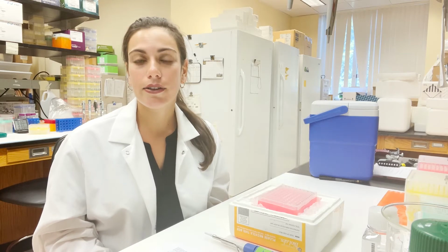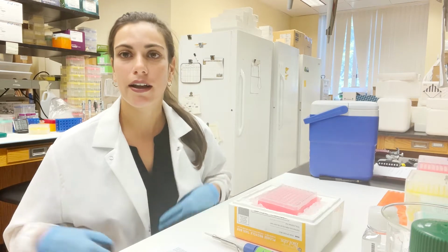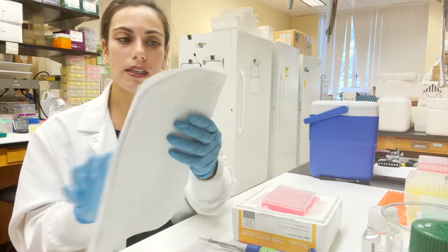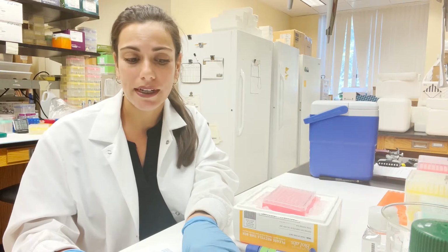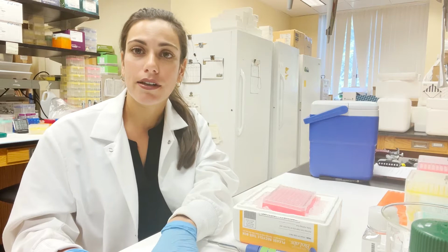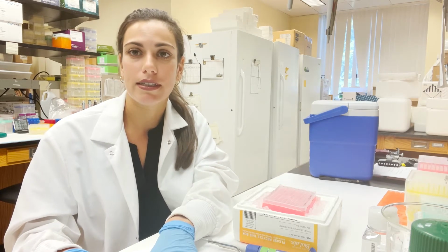Now, the first step after DNA extraction is diluting the DNA of all the samples down to the same concentration. I typically aim for 50 nanograms per microliter, but you can go as low as 20 nanograms per microliter as long as they're all the same concentration. And the way that I keep track is I develop a template in advance that has all of my sample names, what plate they're going onto, what well they're going into, and exactly how much DNA and how much water to add based on the original concentration using the formula C1V1 equals C2V2.